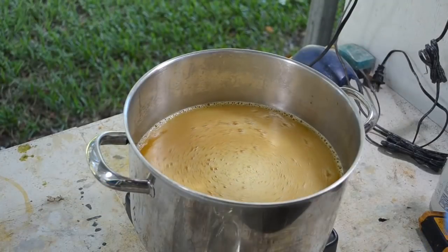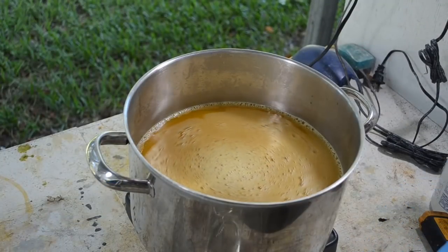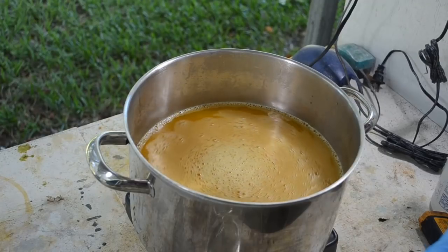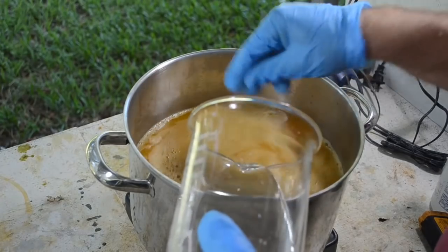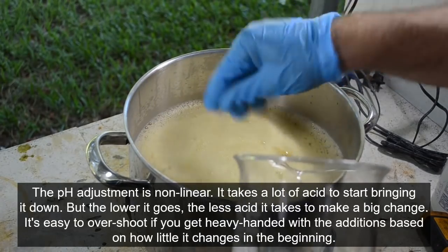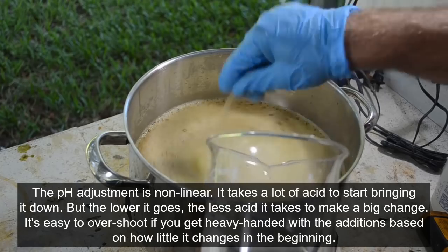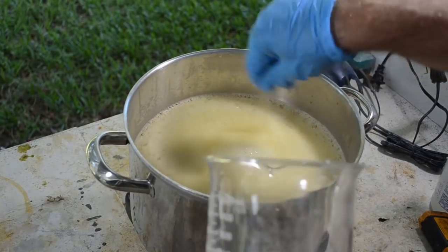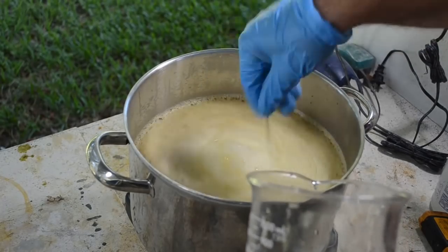So this is going to take a little while. I may even need to mix up some more acid. This may not be enough. But we're definitely starting to bring the pH down. So let me keep this up. And I will put the rest of this acid in, because I've only used about half of it. And we'll see what the pH is. And I may need to mix up some more. Oh yeah, boy, that's foamy. It'll take a while for that head to die down.